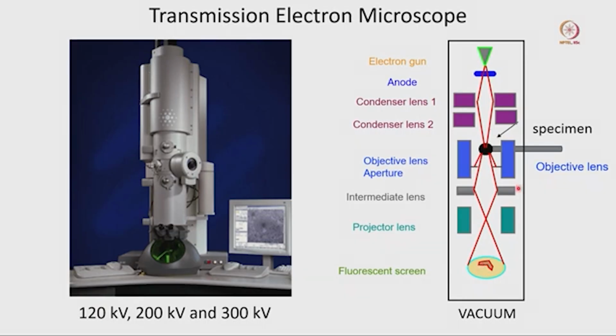So, here we have a 3D object, and the 3D object is giving us a 2D image of that 3D object. So, the 3-dimensional view will not be that clear from these 2D images. As well, if we want to do a surface study, the transmission electron microscope is not a good tool for that. Surface study we can always do using a scanning electron microscope.